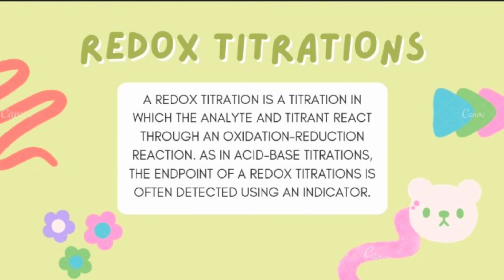Second is the redox titrations. A redox titration is a titration in which the analyte and titrant react through an oxidation-reduction reaction. As in acid-base titrations, the endpoint of a redox titration is often detected using an indicator.